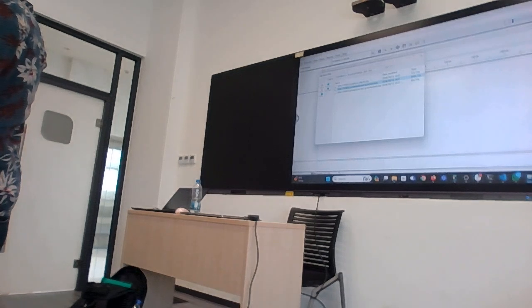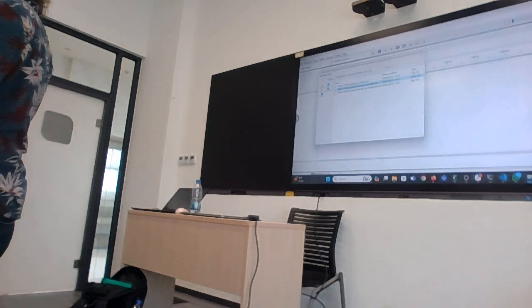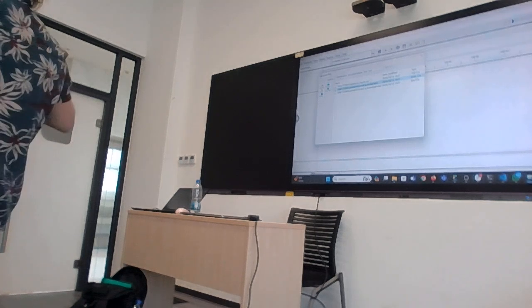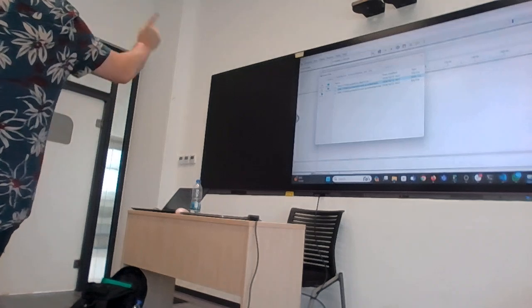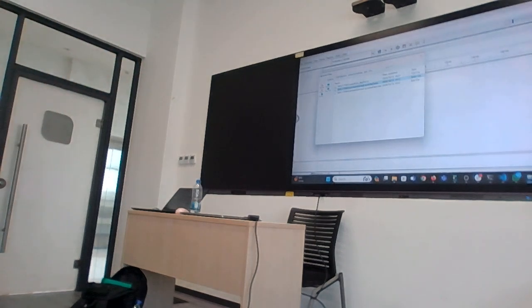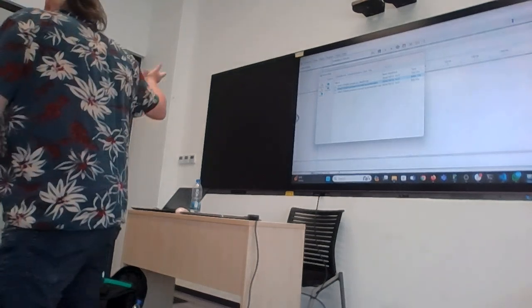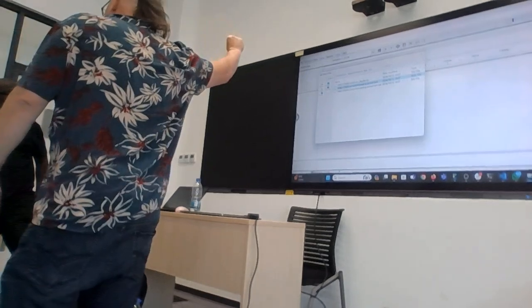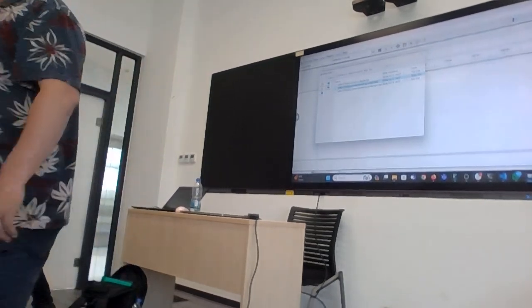Maybe I should pause. Sorry, Stanislas, what are you busy doing? IGV. But everyone must look at IGV together. So let's just, can you paste it with me so that you can translate if needed? Okay? So I showed how to load the FASTA into IGV from load genome, load file. Now I'm loading the BAM file.